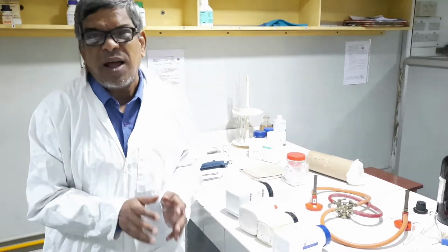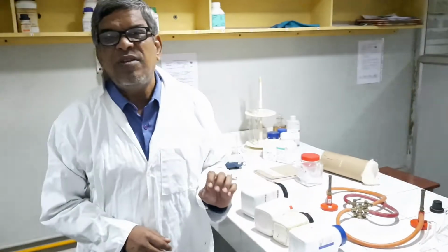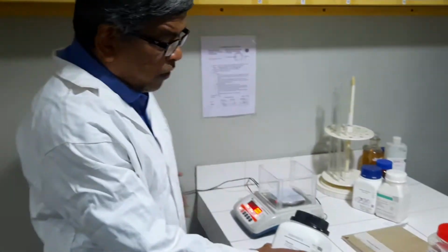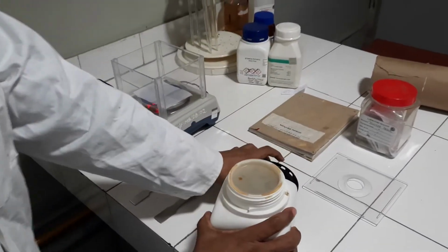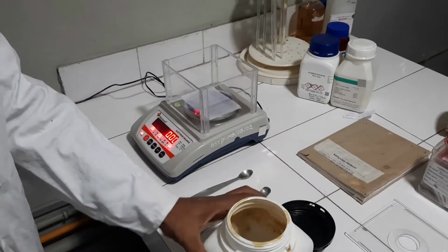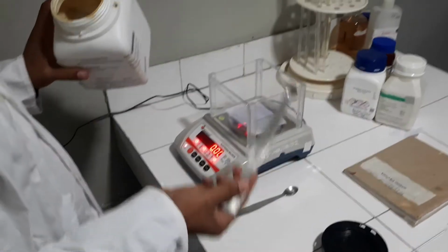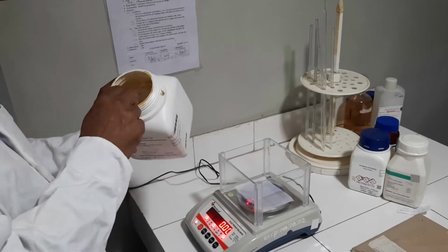So this class is up to this. For liquid media we will use test tubes. For solid media we will use petri dishes, and we will keep it there. So first I am going to weigh peptone 1 gram, right? This is tared already. It says 0, and the 300 milligram butter paper is not weighed. So we will take peptone in a spatula. We should not contaminate. It should be 1 gram peptone.